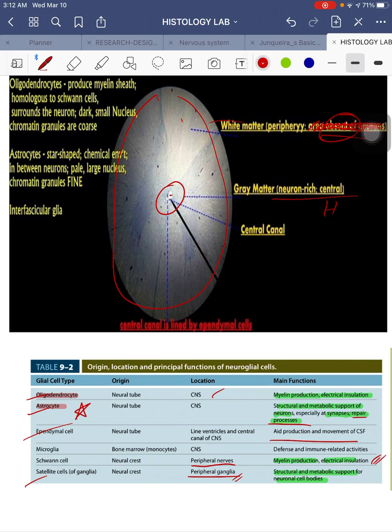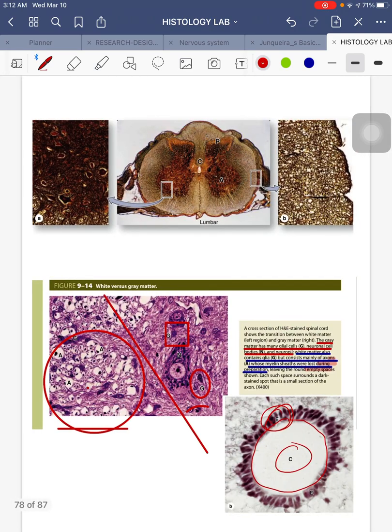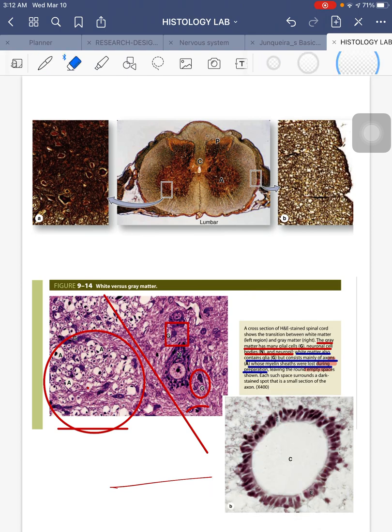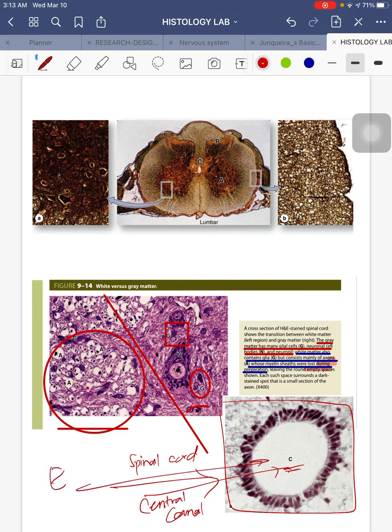The central canal is lined with ependymal cells, and in the bottom picture showing the central canal, the cells lining it — labeled E — are your ependymal cells. So if asked to identify the specimen, the answer is spinal cord; if asked to identify the area pointed at, it is the central canal; and if asked to identify the cell, it is the ependymal cell.